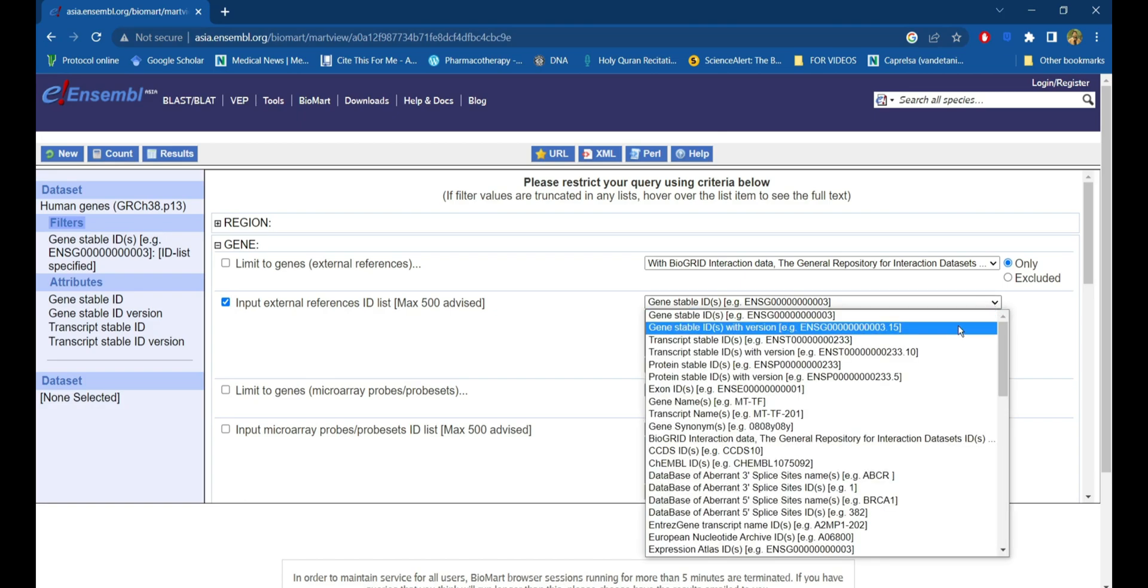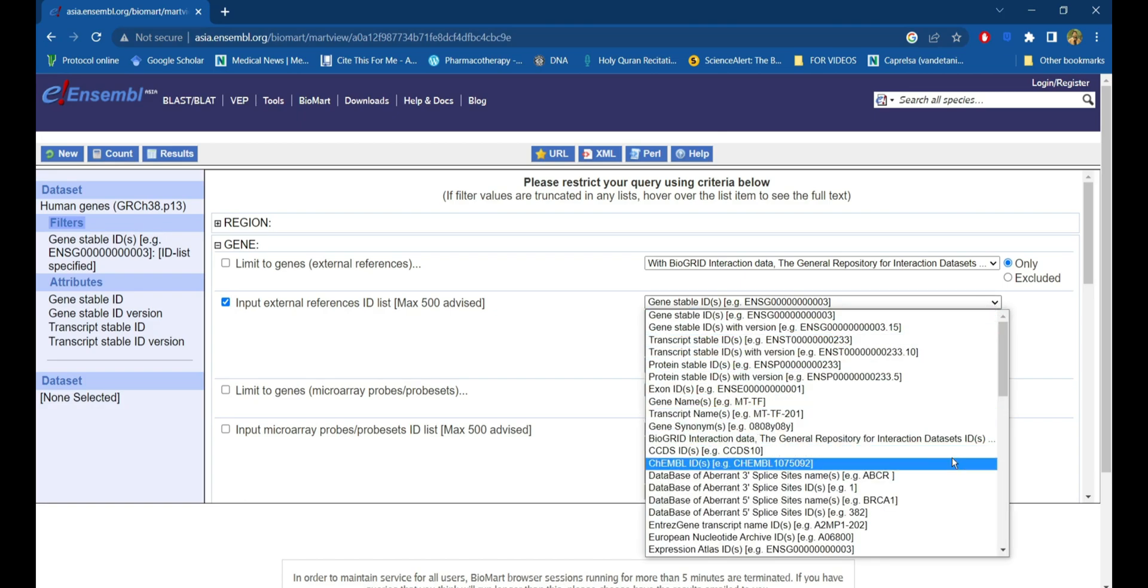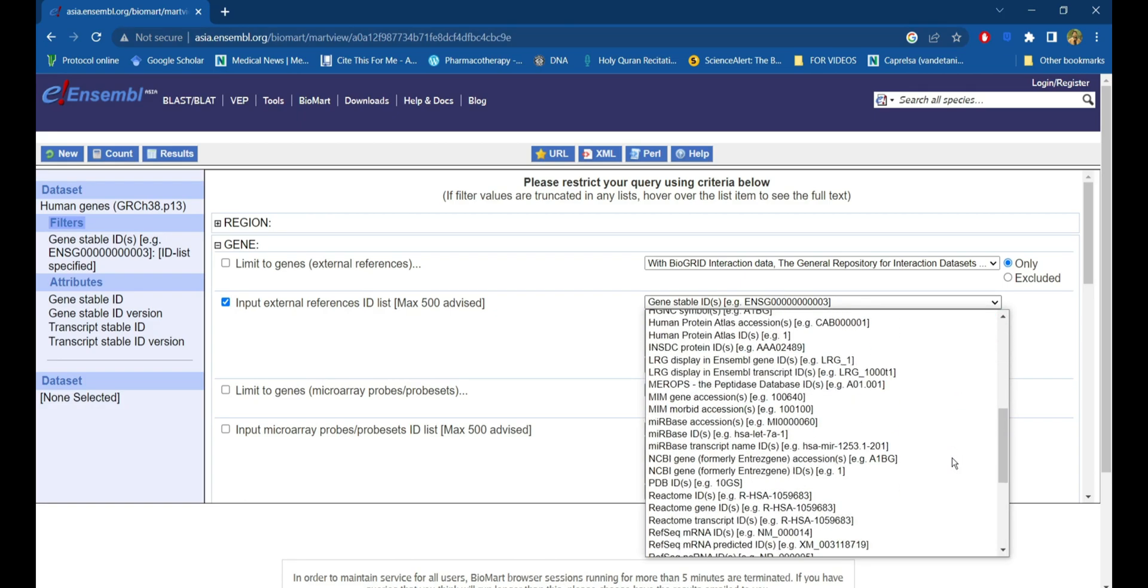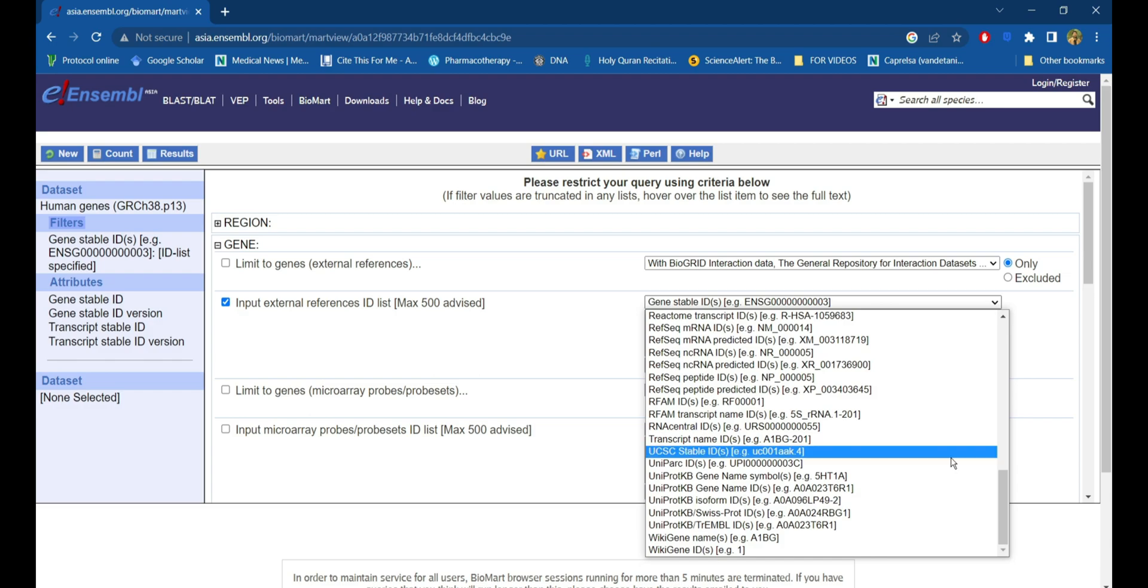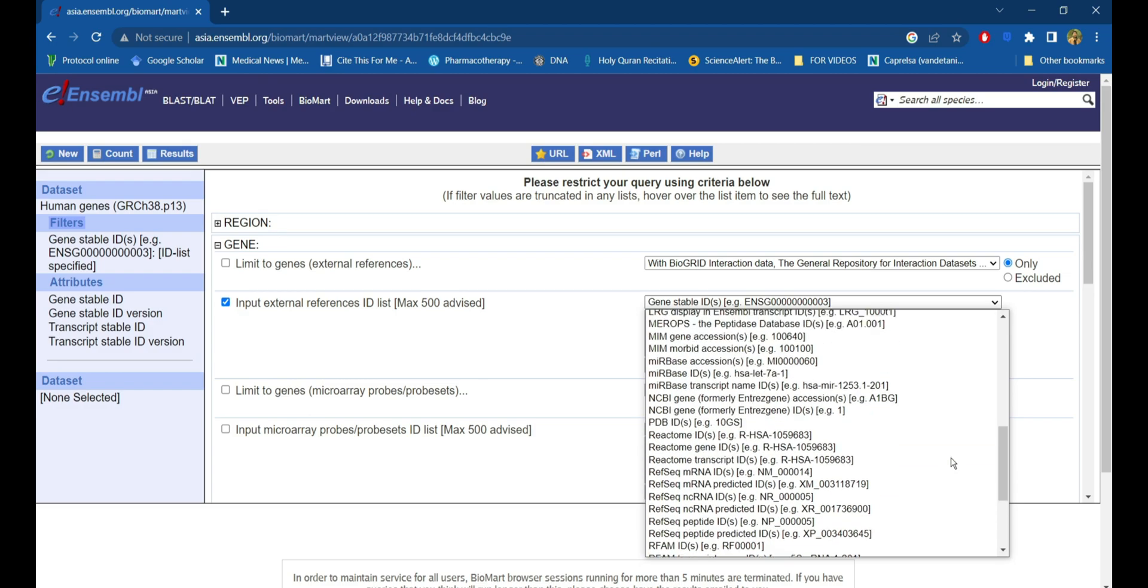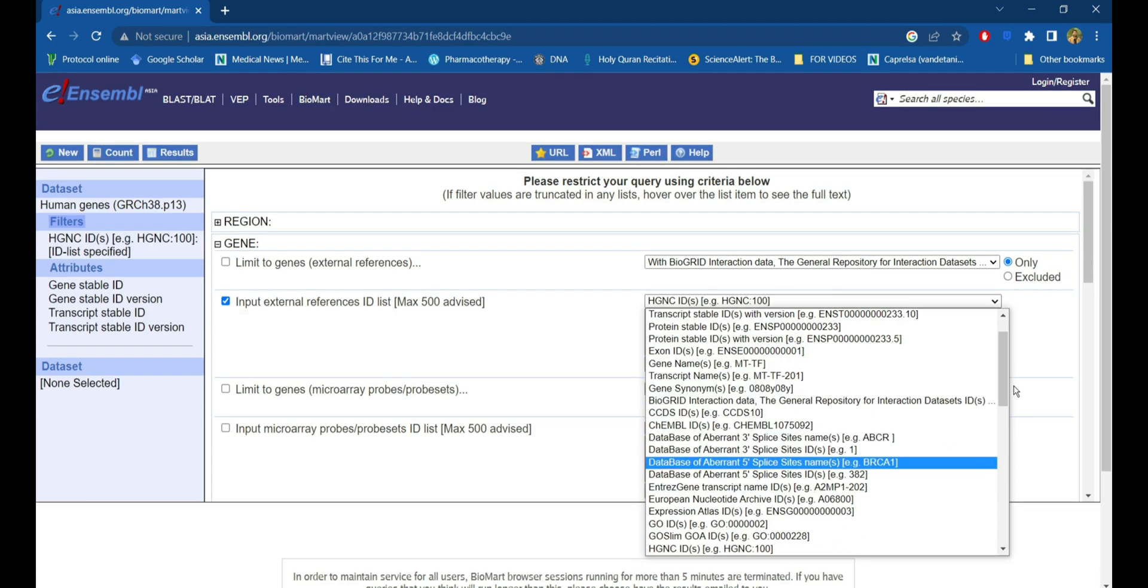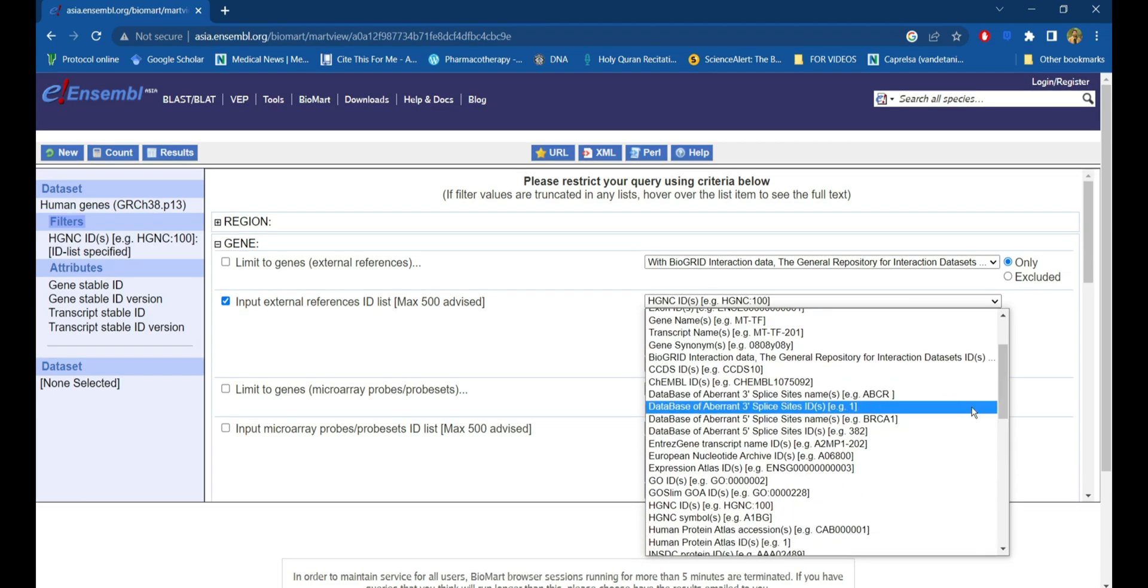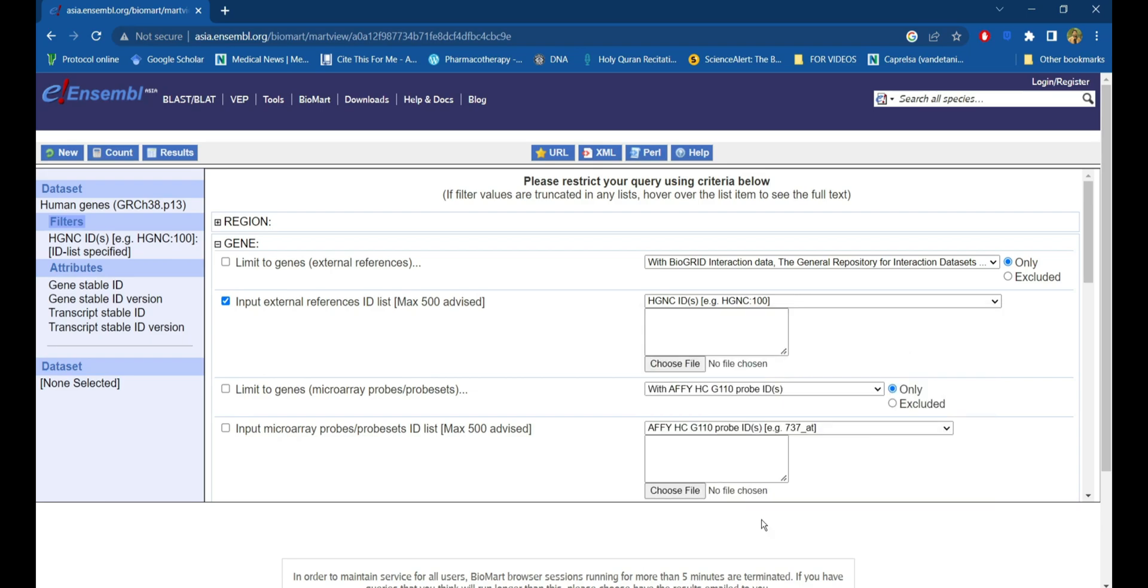Under the input external reference ID list, you can choose several varieties of inputs. Here I'll be searching based on the HGNC name of the genes. I have pasted the gene list.